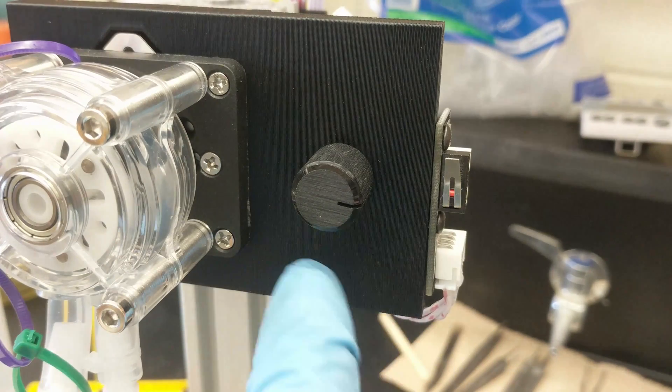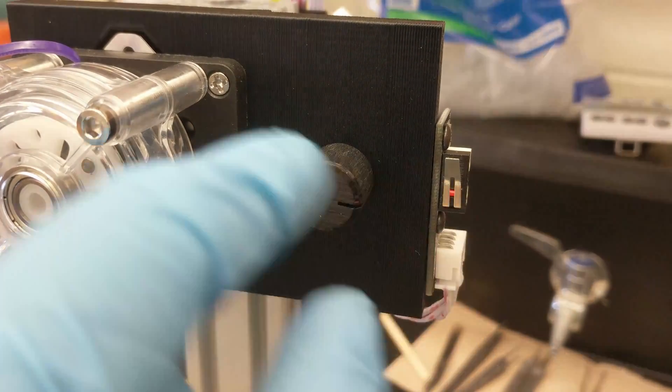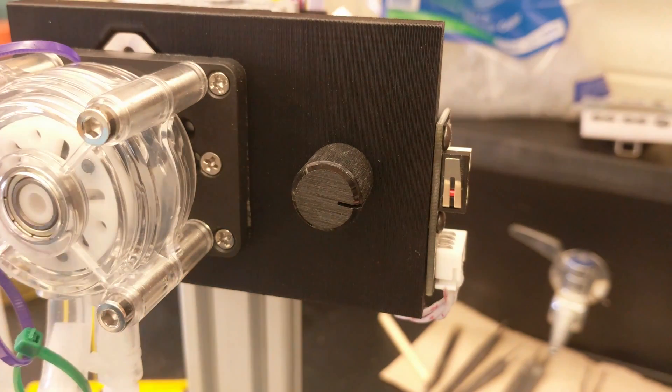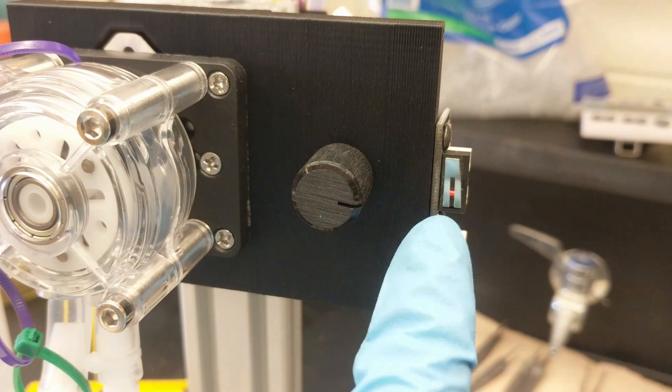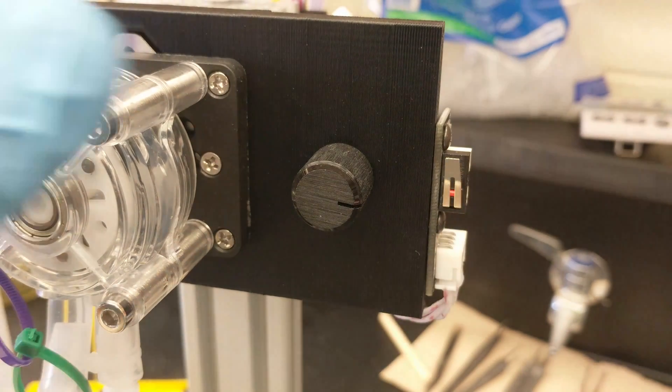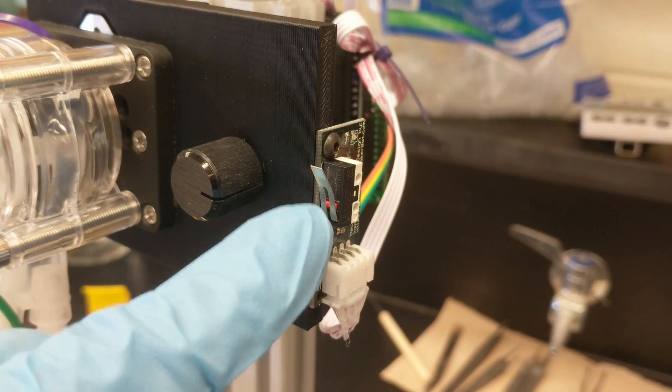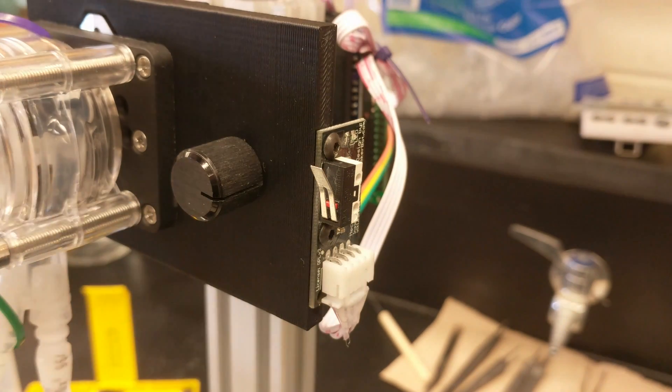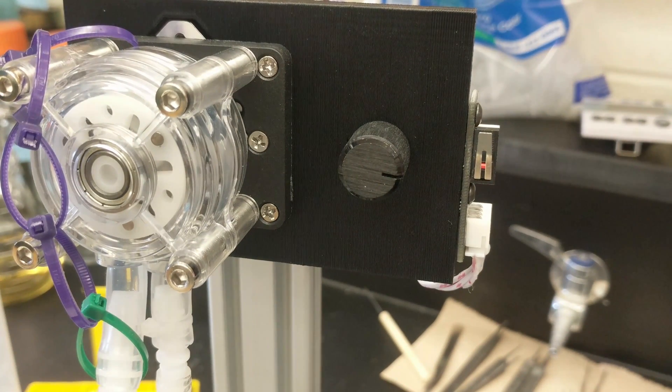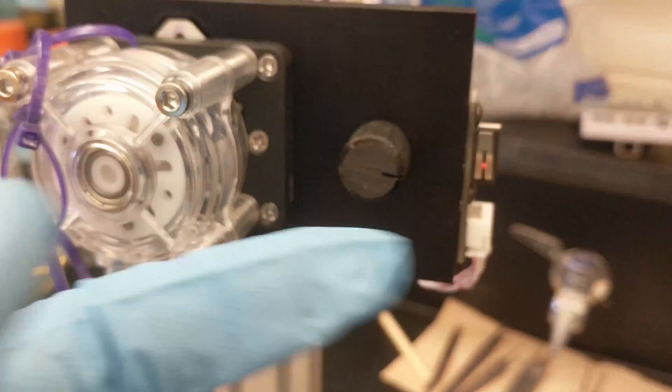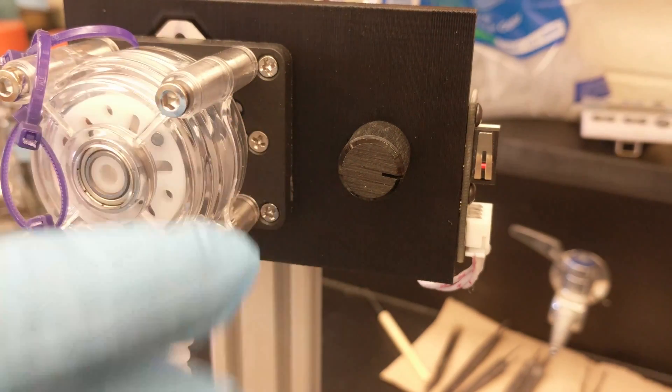Here's the potentiometer which actually controls how much volume the pump dispenses per press, and then I've attached a little button that I've had laying around for a while. It had the wire on it and everything so it was just convenient, but you could use any sort of button that you'd like. And basically that's it: you have a controller, a stepper motor driver, a button, and a potentiometer.